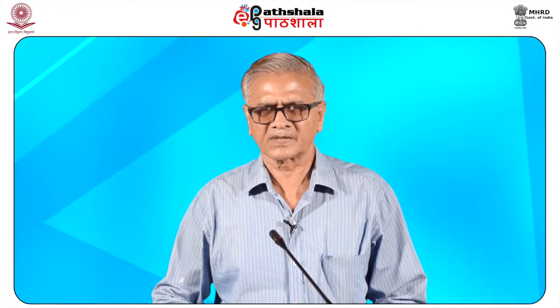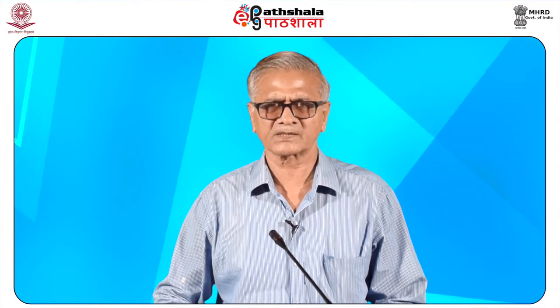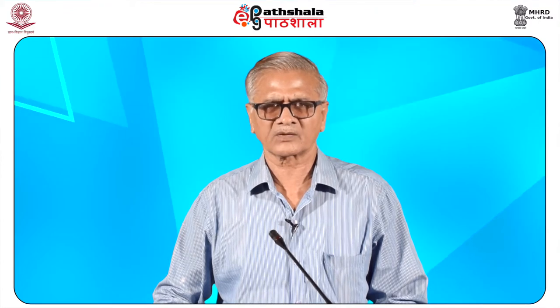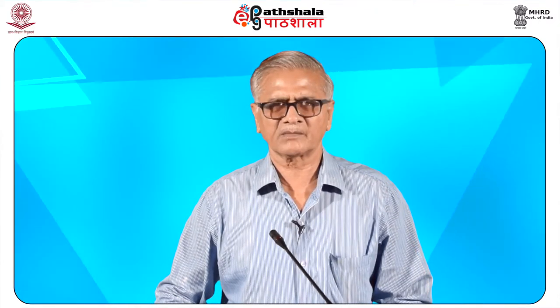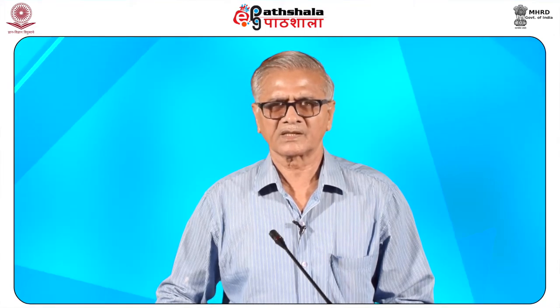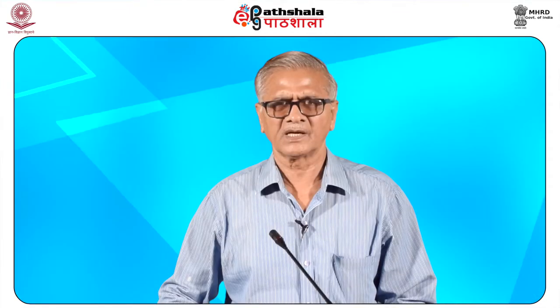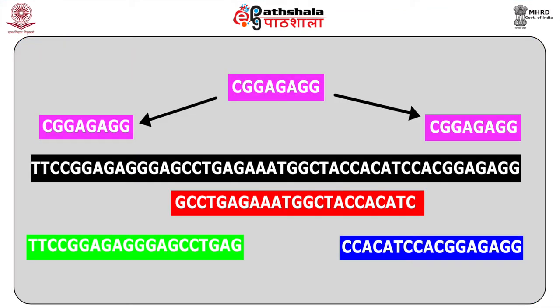Sequence assembly refers to the reconstruction of a DNA sequence by aligning and merging small DNA fragments. It is an integral part of modern DNA sequencing. Since presently available DNA sequencing technologies are ill-suited for reading long sequences, large pieces of DNA, such as genomes, are often sequenced by cutting the DNA into small pieces, reading the small fragments, and reconstituting the original DNA by merging the information on various fragments, as shown in this diagram. The sample sequence shows how a sequence assembler would take fragments and match by overlap. The image also shows the potential problem of repeats in sequence.